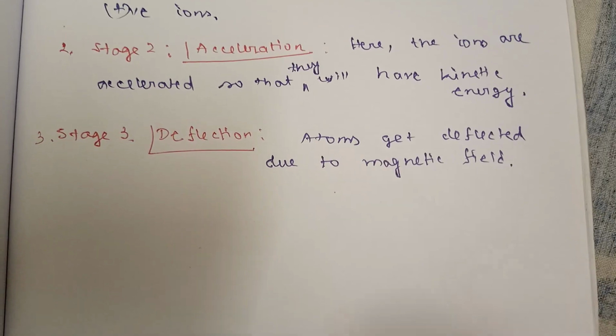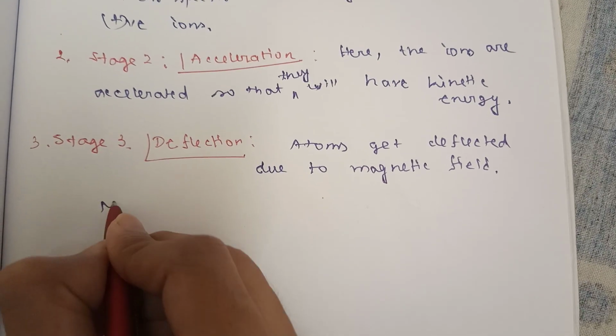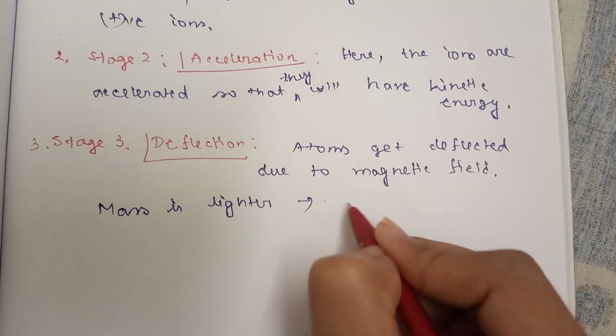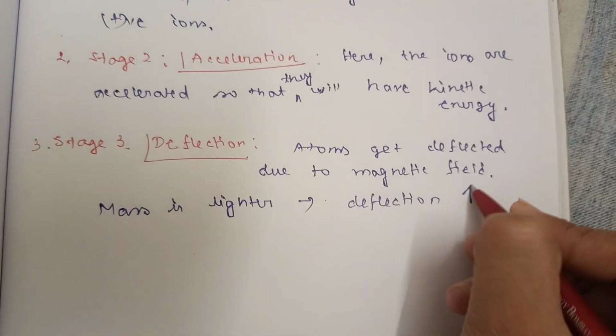Now this deflection differs: if the mass is lighter, then deflection will be more.